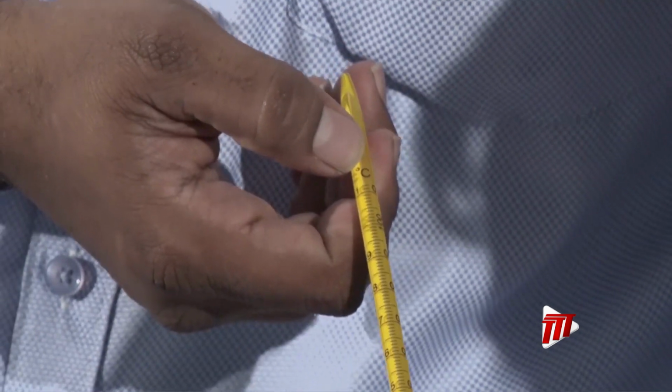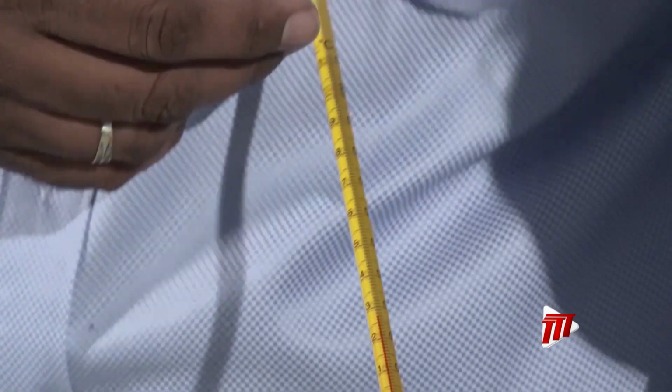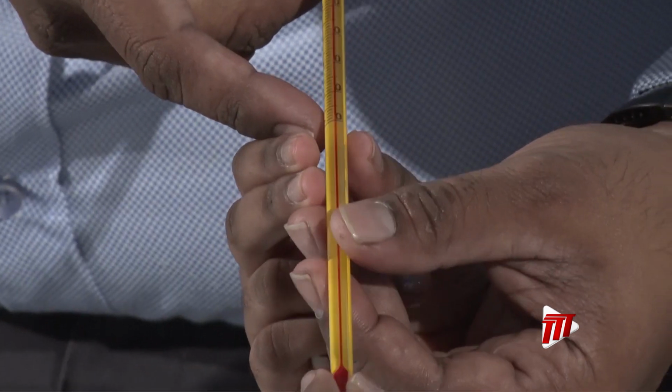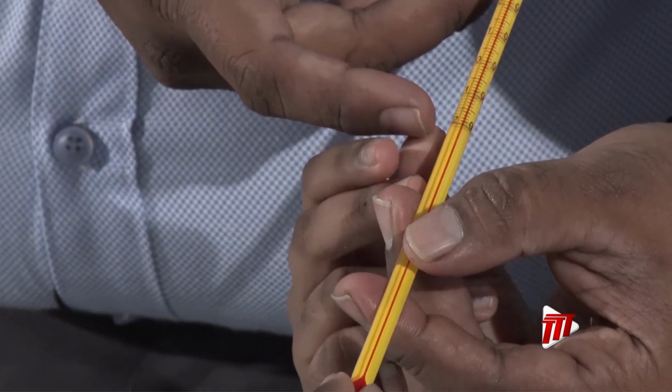That's what we are measuring in. And then we would have all the numbers, the 110 degrees Celsius, which we spoke about, and going all the way down, this one goes to -20.